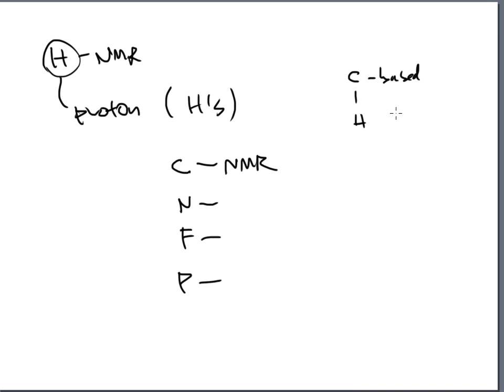So this is one of the reasons that hydrogen NMR is so important, because if I take something very simple, let's say ethanol, CH3, CH2, OH. Let's go to the ABC store and buy some Everclear, because that's what ethanol is. So CH3, CH2OH, HNMR is going to be doing a test on ethanol, and HNMR will focus on hydrogens.